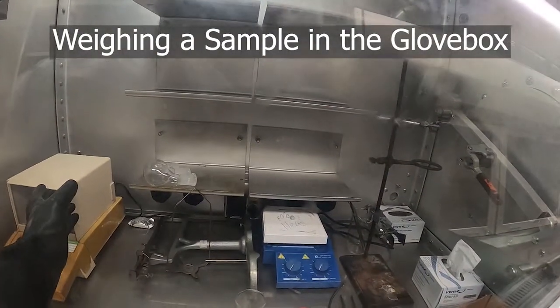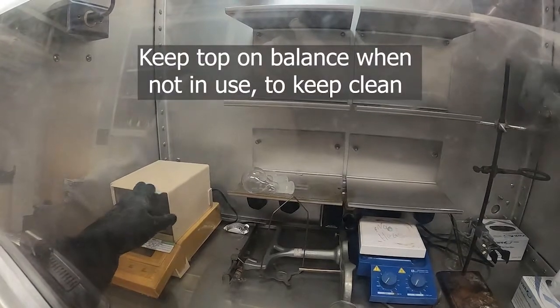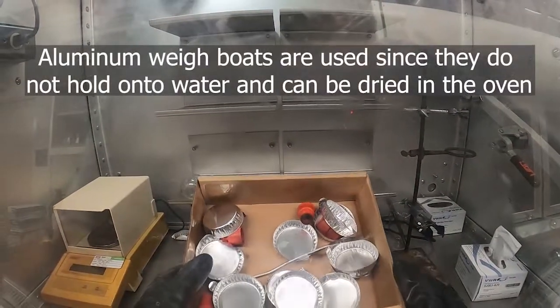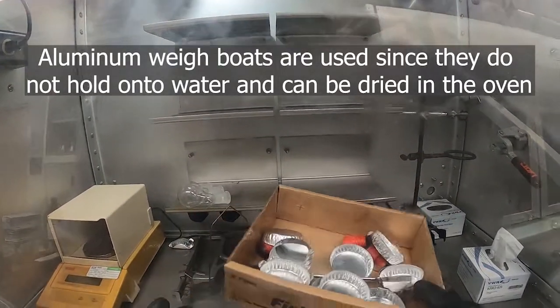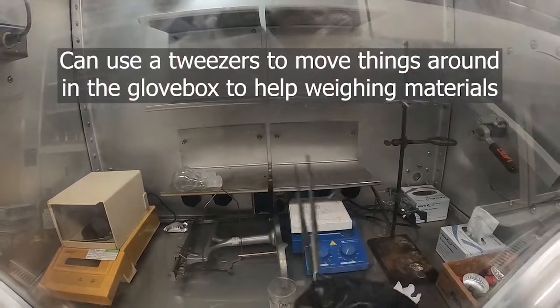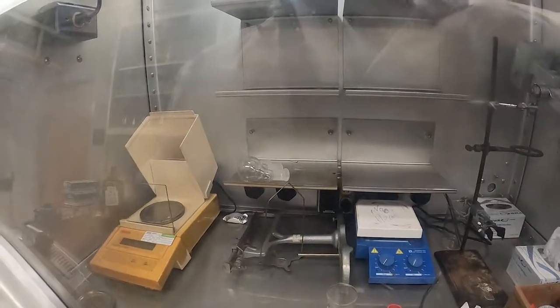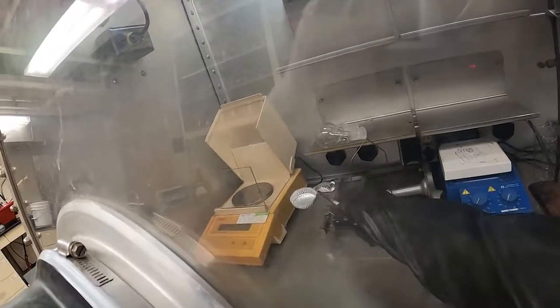If you're going to weigh a sample in the glovebox, it's important to keep the lid on your balance closed until you're going to use it, to prevent things from getting in there. We use aluminum weigh boats in the glovebox because they can be oven-dried; plastic or paper weigh boats will retain water, which is obviously something we don't want in the glovebox. Weighing things on the balance in the glovebox is just the same — use your tweezers to move things around, like your weigh boats.